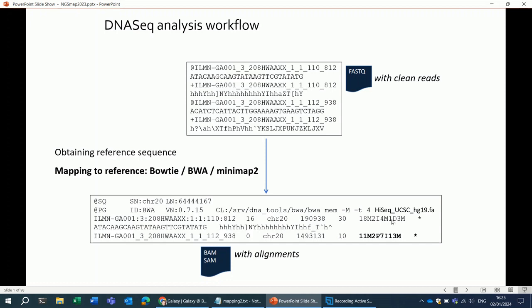In the CIGAR string, you can see, for instance, whether there are gaps in the alignment. The I here and the D represent gaps in the alignment.